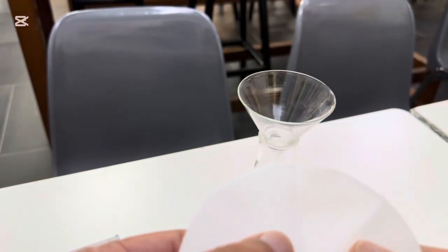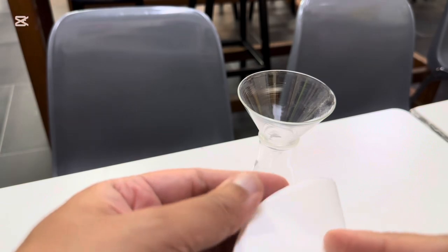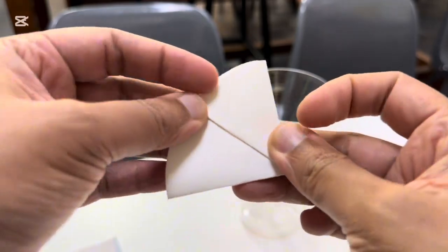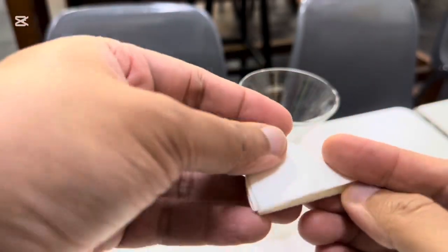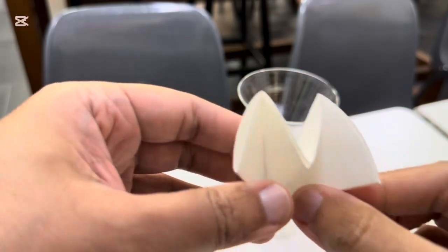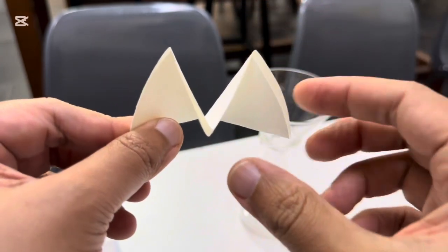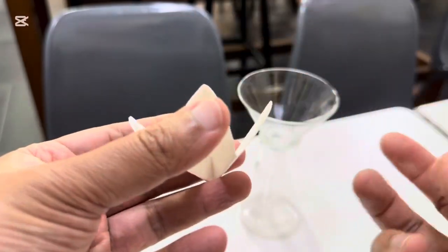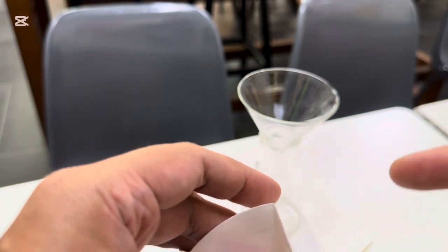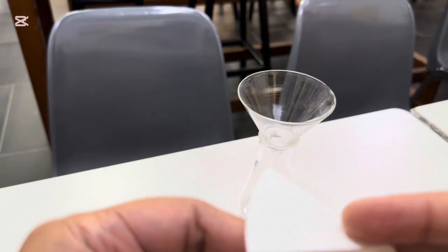So you start with your traditional folds here, and then you fold it once, it's a quarter, you fold this bit upwards, and then you turn it around and fold this bit upwards as well, or downwards, depending on which way you're looking at it. If you do it correctly, you'll get a letter M forming if you look at the side, or it could be a little letter W. I don't know. Right, at this point, you want to have a waggle all the way through.